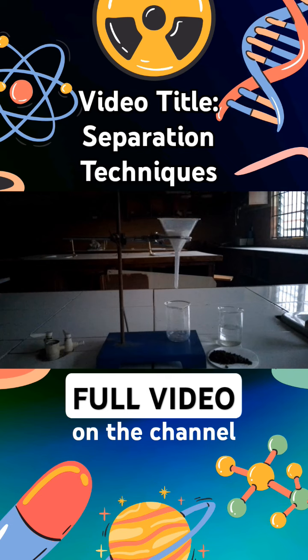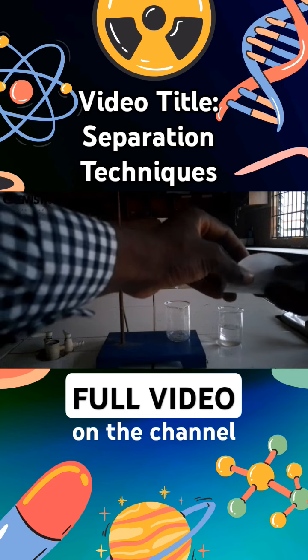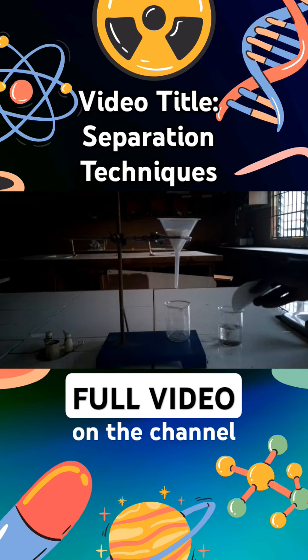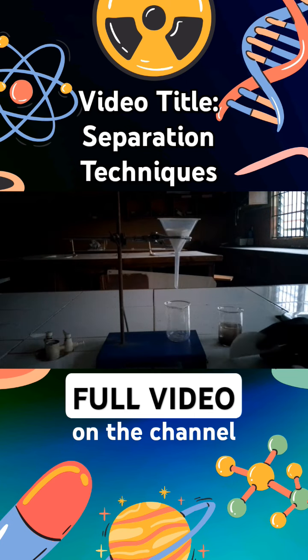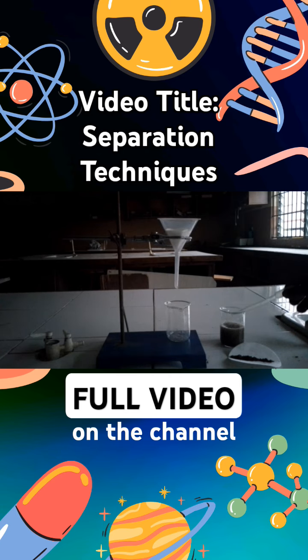Now, the next thing is I'm going to mix the sand and the water together. I'm simply going to do that by pouring the sand inside the water sample. So right now I have formed the mixture of soil and water. Let me stir it together. All right. So the next step is we are going to try to separate this particular mixture into its primary constituents, which are the water and the soil.